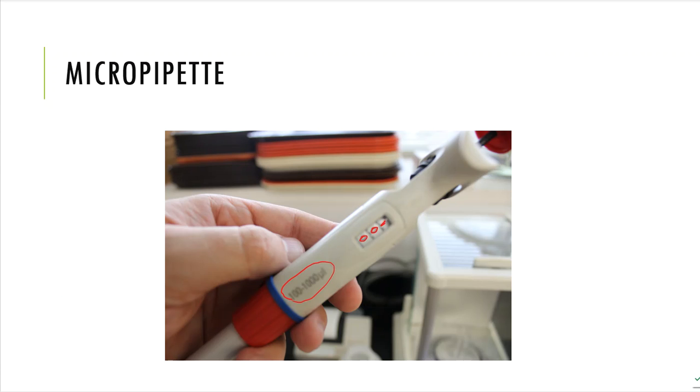Here's the problem with the micropipettors that we have here. There's only room for 3 numbers. And 1,000 has 4 numbers. So we have to make do. These things are made on a manufacturing line. They are adjusted. They are fine-tuned for different amounts. And the majority of them only have 3 digits.